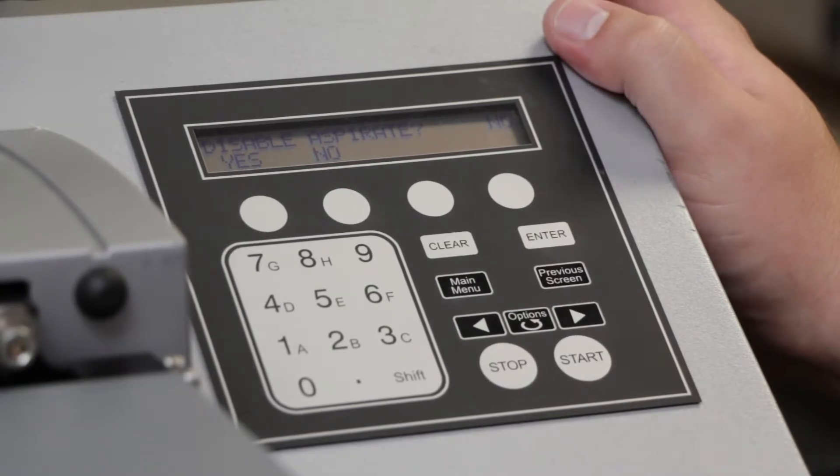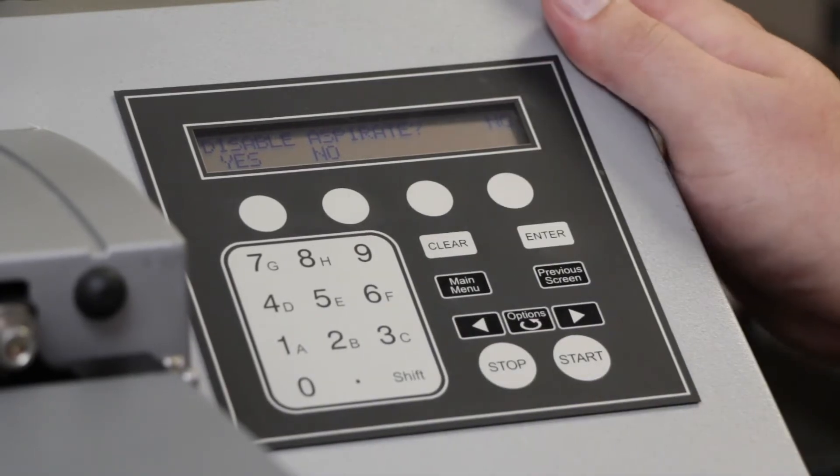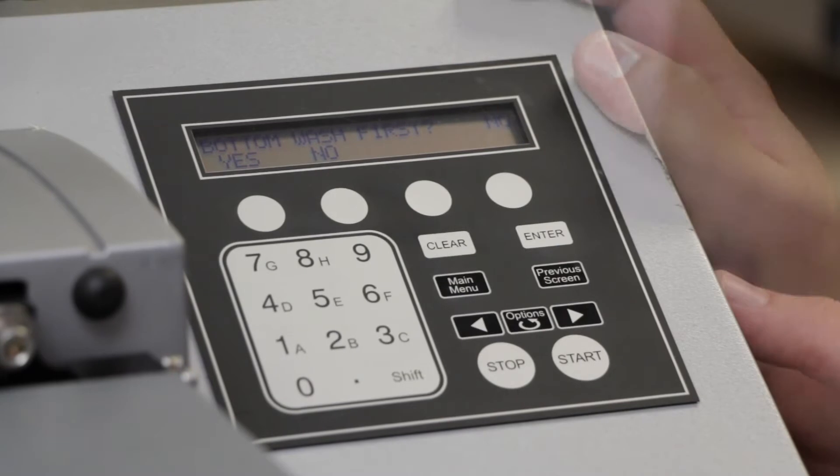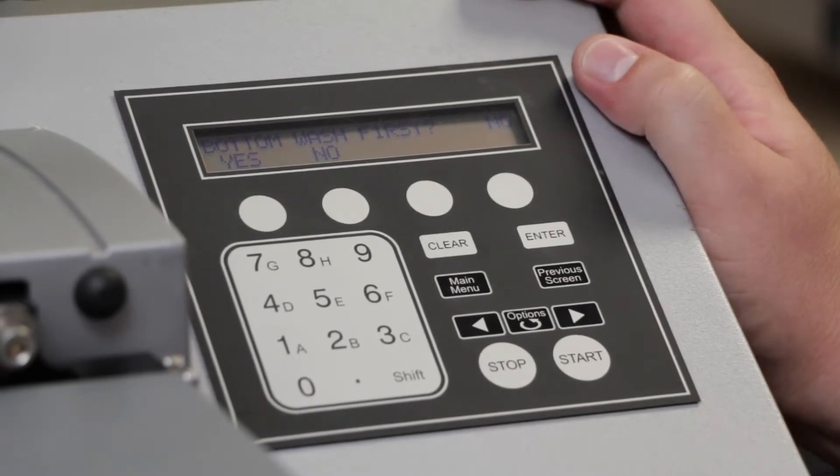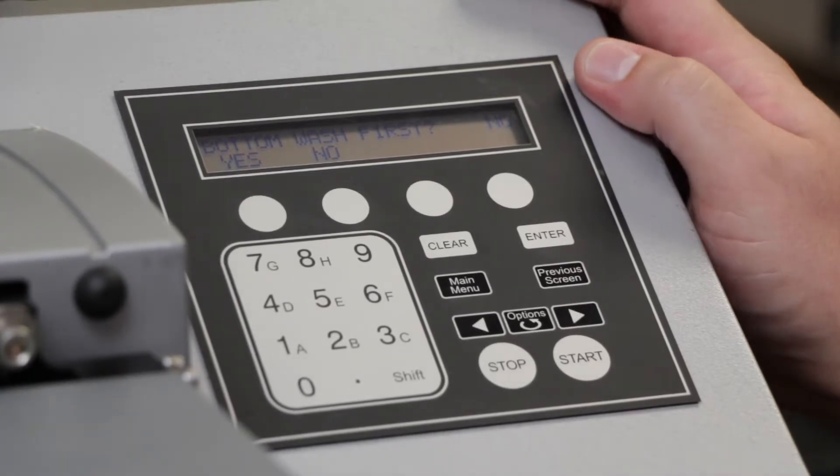Disable aspirate option is useful for if you're running a bead assay or any situation where you don't want the aspiration to run while you're dispensing. Since the aspirate tube sits so close to the dispense tubes, this can be an issue with some options. In our case, we're not concerned with that, so we'll leave the disable aspirate off. Bottom wash first adds an extra aspirate and dispense to the beginning of your cycles. In our case, we're not going to be utilizing this, so we'll press no.